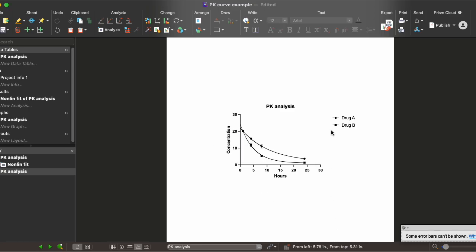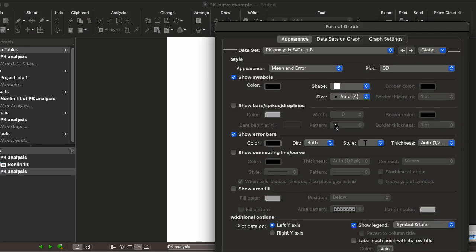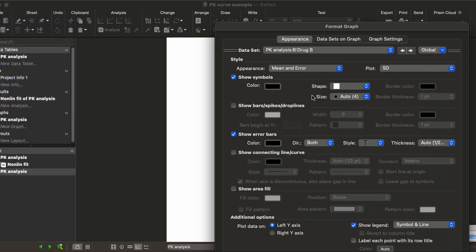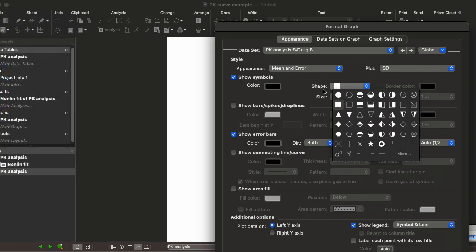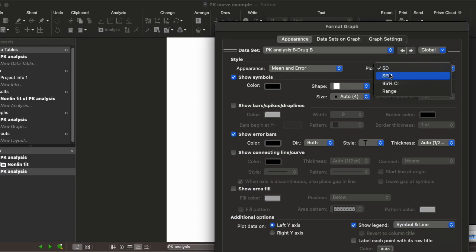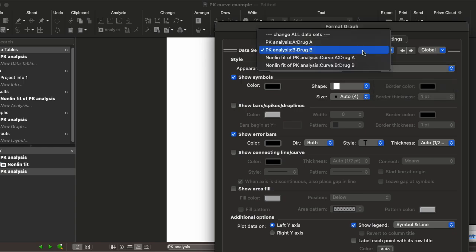You can always change the symbols or the colors of your two data sets just by double-clicking on the group and changing the colors or the shape. You can also change the error bars to show standard error of the mean instead of standard deviation, and you can just toggle the data set up here.